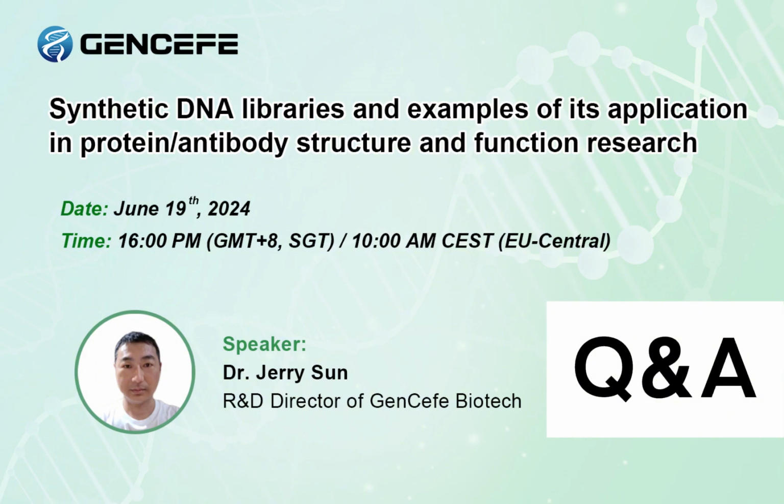What do you mean by naive library? A naive library means not having any gene. You don't know the prior information of any gene. So you just take any random sequence, do random mutations, and just screen. Like a synthetic library. In synthetic chemistry, they do random libraries. Like that, do you provide any library?